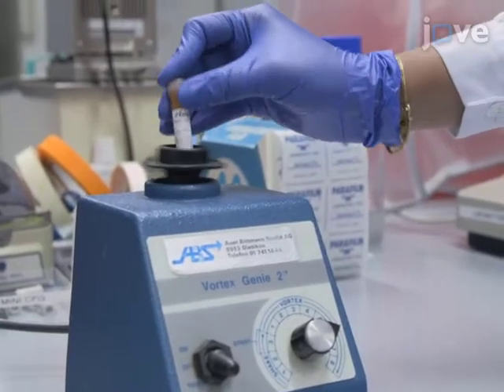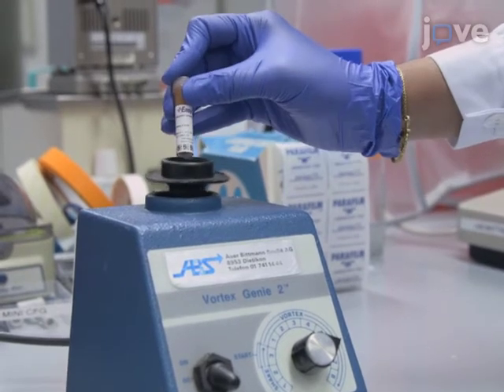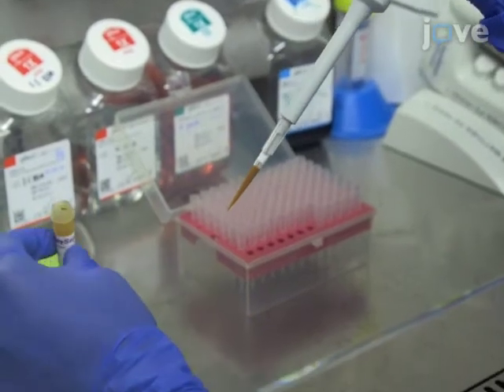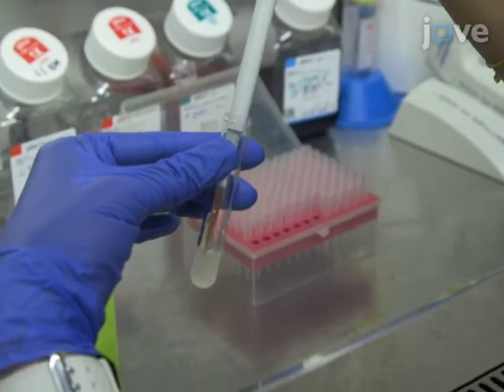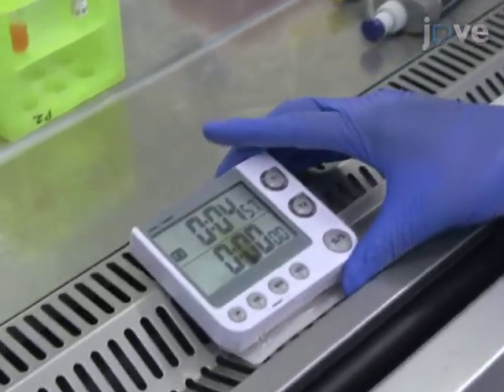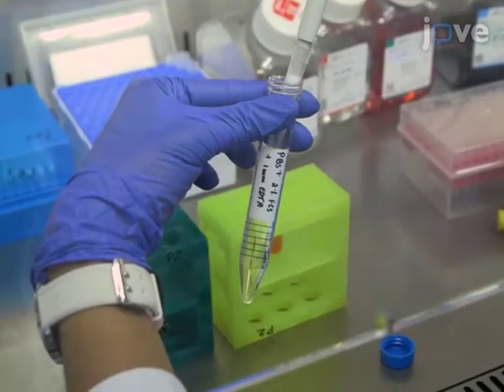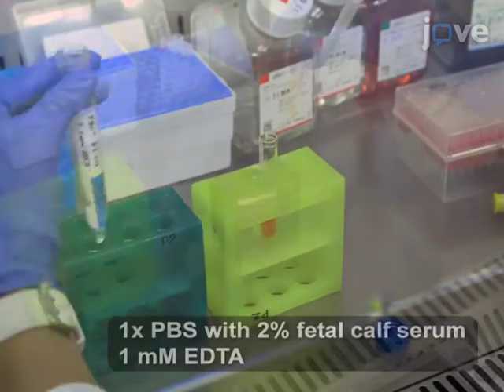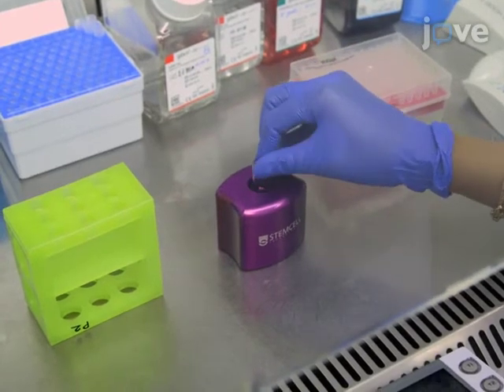In the meanwhile, vortex the magnetic particles in the B-cell enrichment kit for 30 seconds. Then, add 150 microliters of the magnetic particles to 2 milliliters of cell suspension. Incubate the cell magnetic particle mixture at room temperature for 5 minutes. Adjust the sample volume to 2.5 milliliters. Then, place the tube in the magnet and incubate for another 3 to 5 minutes.